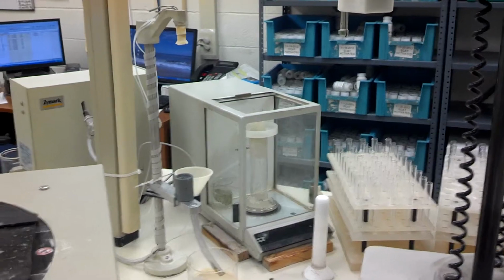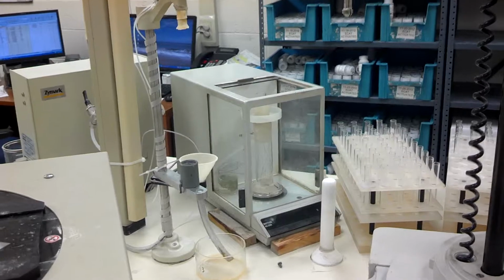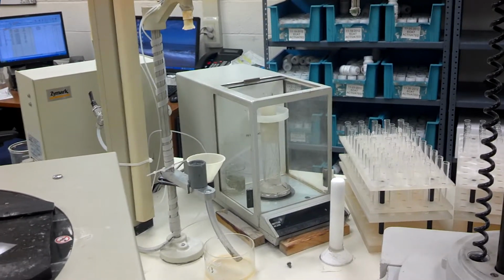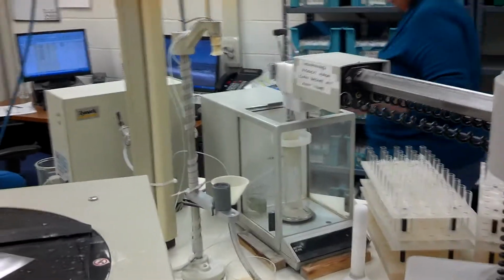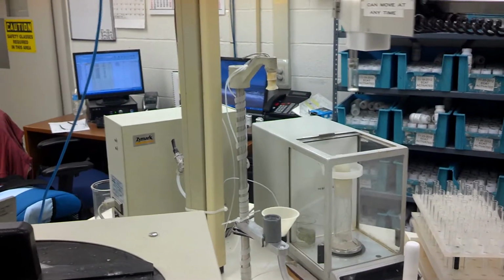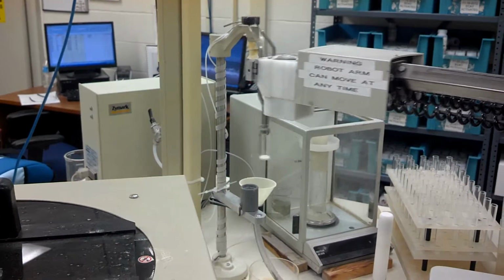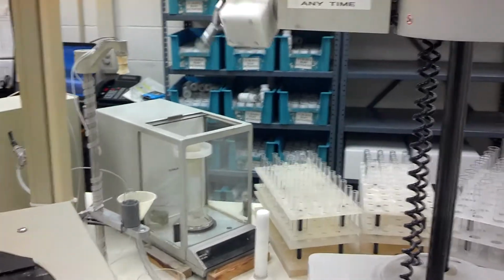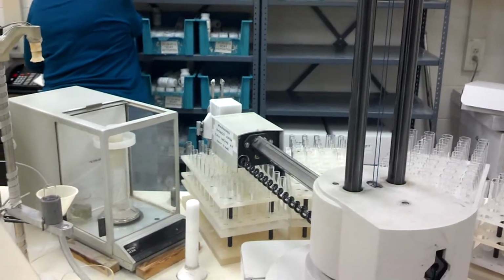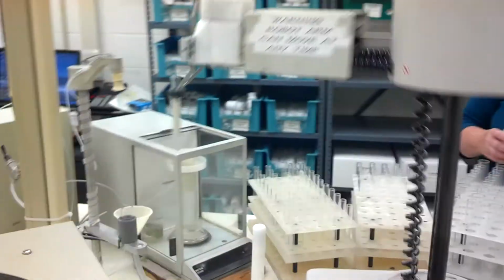Okay, so you're measuring the vessel with the powder in there. Yes. But the powder is pre-dispensed into the vessel, right? Yes. Okay, then you're going to take that vessel and put it over here, and you're going to add another powder, right? Yes. Compound, I guess, I'm not sure. It's catalyst, actually. A catalyst, okay, so you're going to add a fluid cracking catalyst is what we call it. A fluid cracking. They use it in the refinery industry. You've got to forgive me, it's not my profession, so I don't understand all the acronyms and lingo and all that.